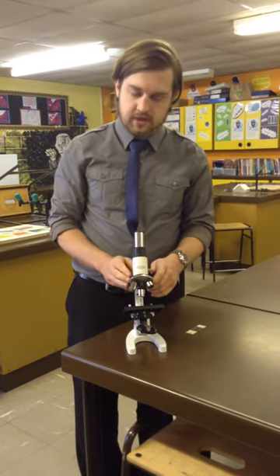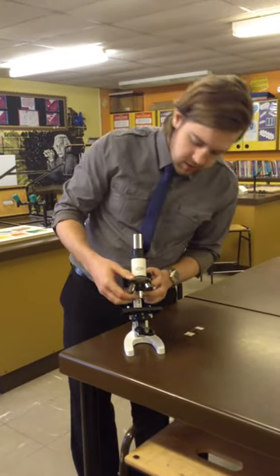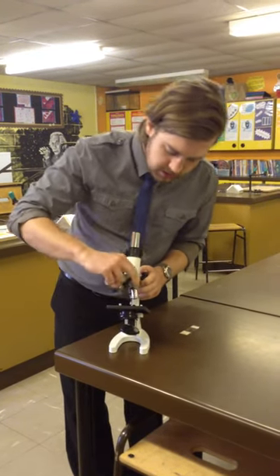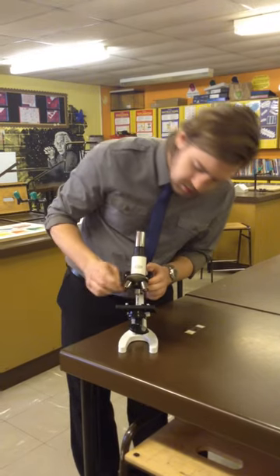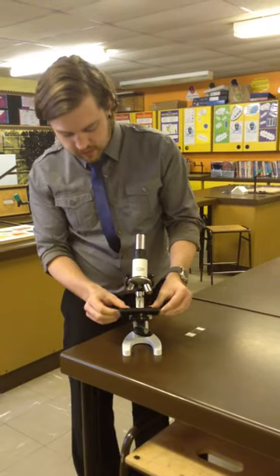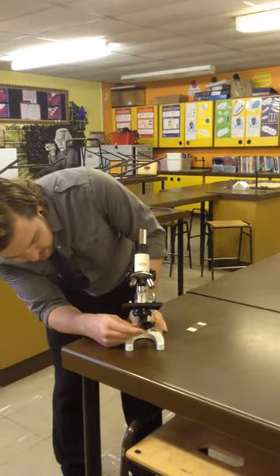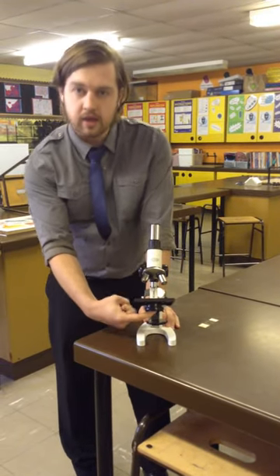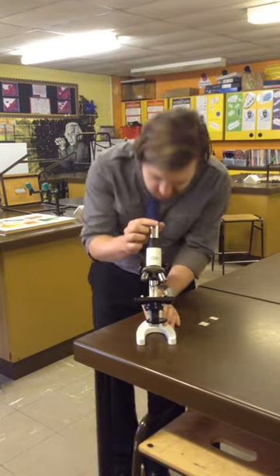The next thing you need to make sure you do, make sure that you have these lenses set to the smallest possible one. So in this case it's the times four magnification. Now we can alter the mirror and make sure that we have light going off the mirror and up through the aperture hole through to the eyepiece.